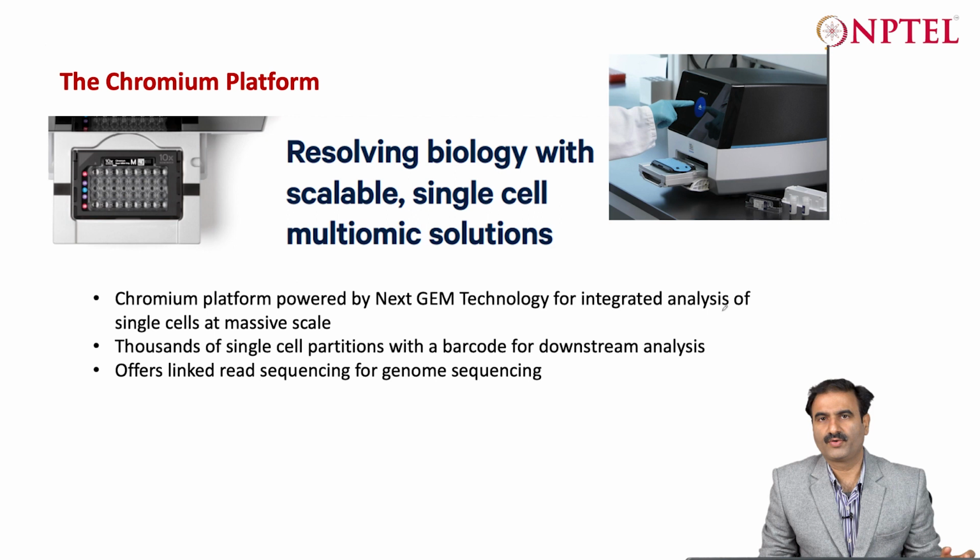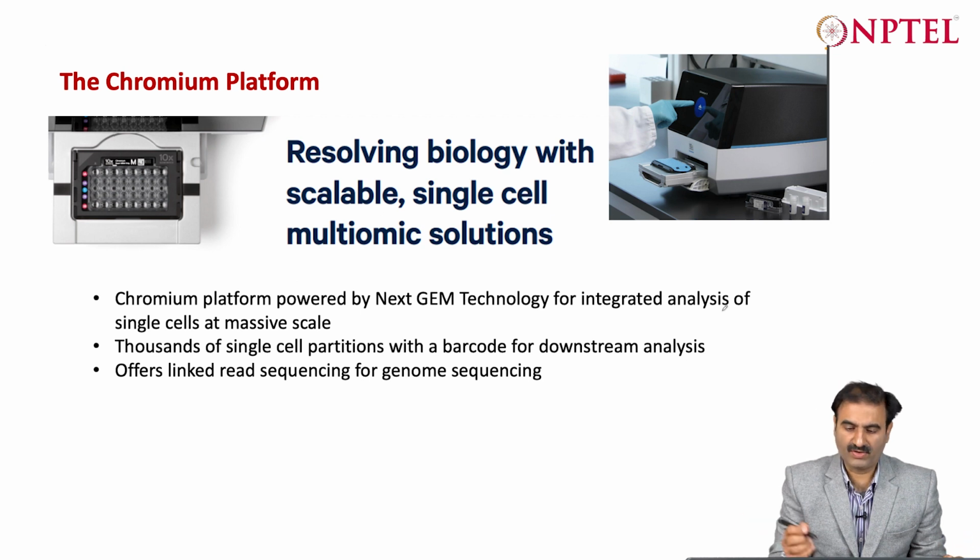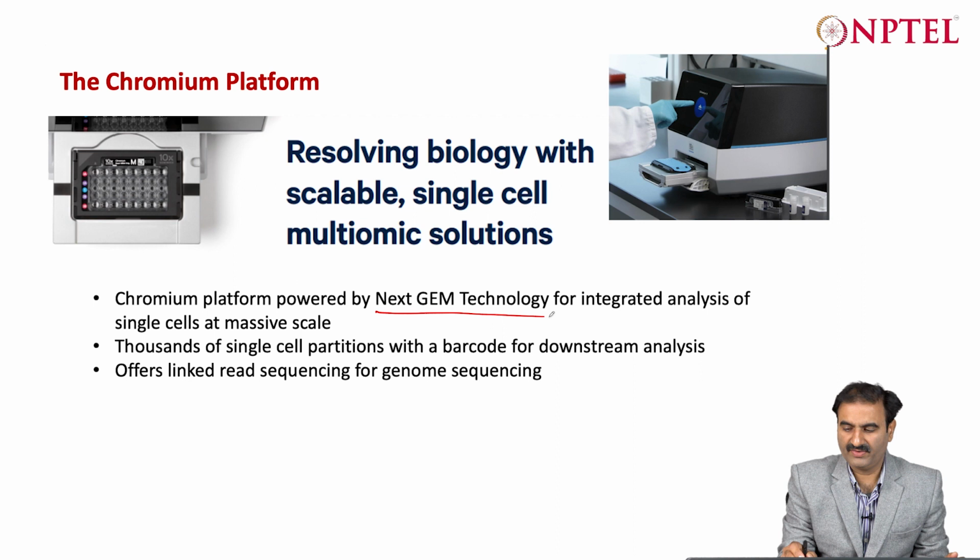The Chromium platform was developed with the purpose of doing single cell genomics, and producing link reads is one of the outcomes of it. They call it GEM technology, for the analysis of single cells at massive scale, including genomics and transcriptomics, right?